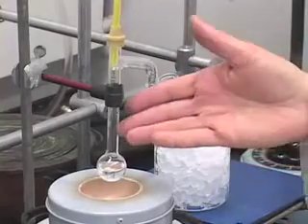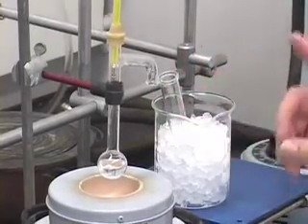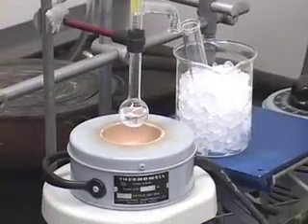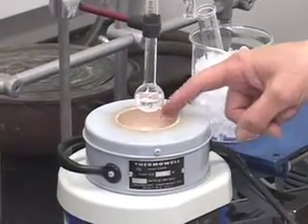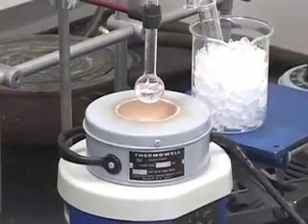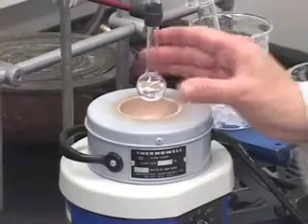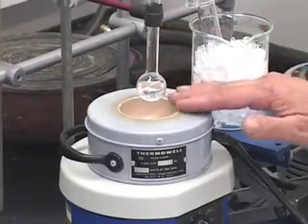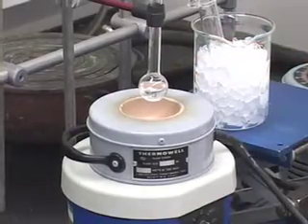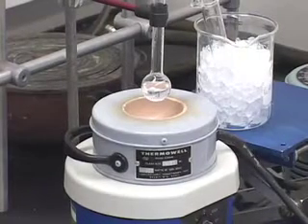We also want to make sure that the round bottom flask is going to be sitting in the heating medium of the mantle. What do I mean by heating medium? Notice that the heating well is much larger than the size of the flask. If the heating well is the same size as the flask, then you don't have to add anything, because the flask will sit snugly inside the mantle and so it will be efficient heating.